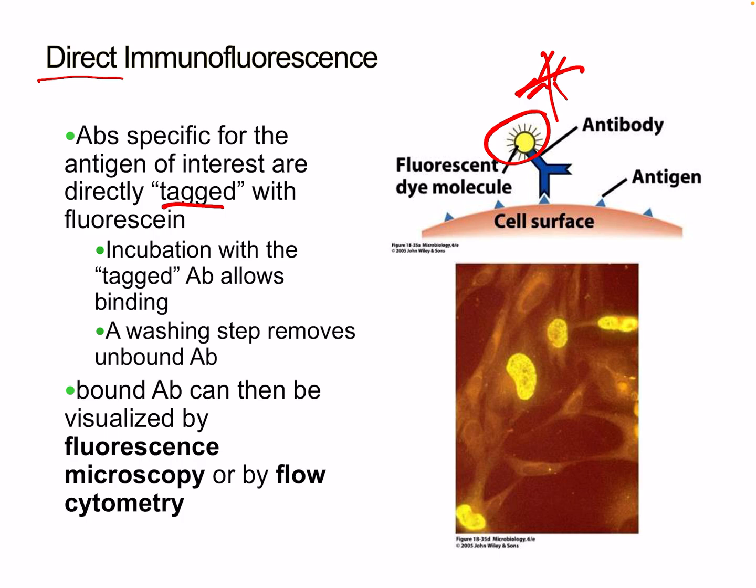Incubation with the tagged antibody allows binding. A washing step removes the unbound antibody. Bound antibody can then be visualized by fluorescent microscopy or by flow cytometer. So here's that picture we saw at the start.